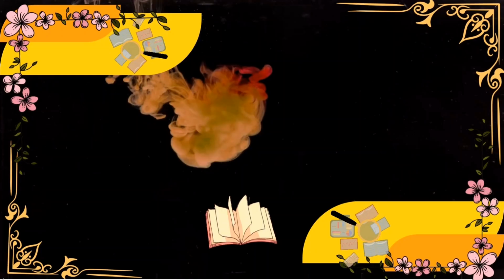The sample, that is food or biological material, is placed in a sealed chamber where gas exchange is expected to occur. A pressure transducer is attached to the closed chamber to monitor any changes in the internal gas pressure. As gases are consumed, that means oxygen, or produced, that is carbon dioxide, the total pressure inside the chamber changes. The pressure transducer senses these changes in pressure and converts them into an electrical signal that is proportional to the gas exchange. The pressure data can be continuously recorded and analyzed to determine the rate of gas production or consumption.